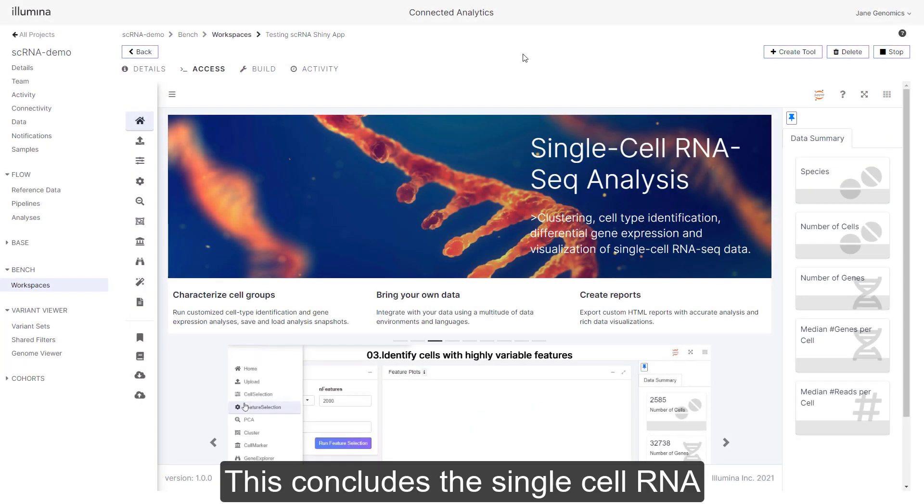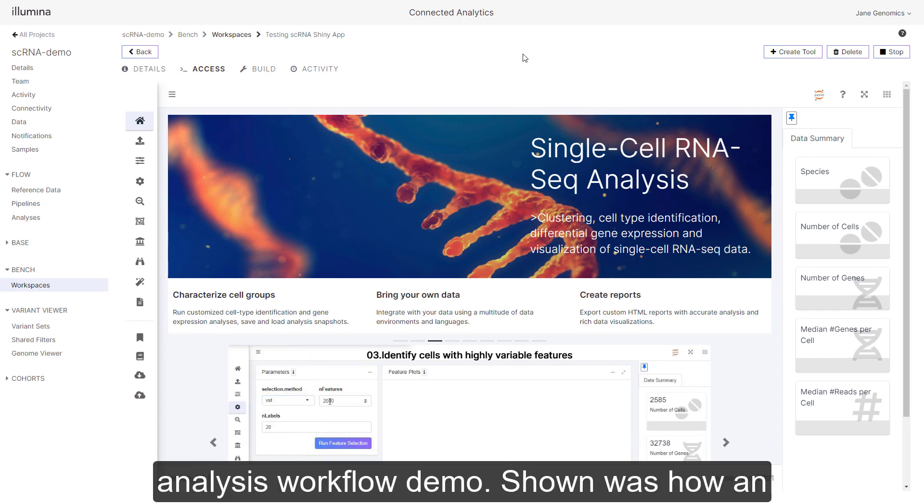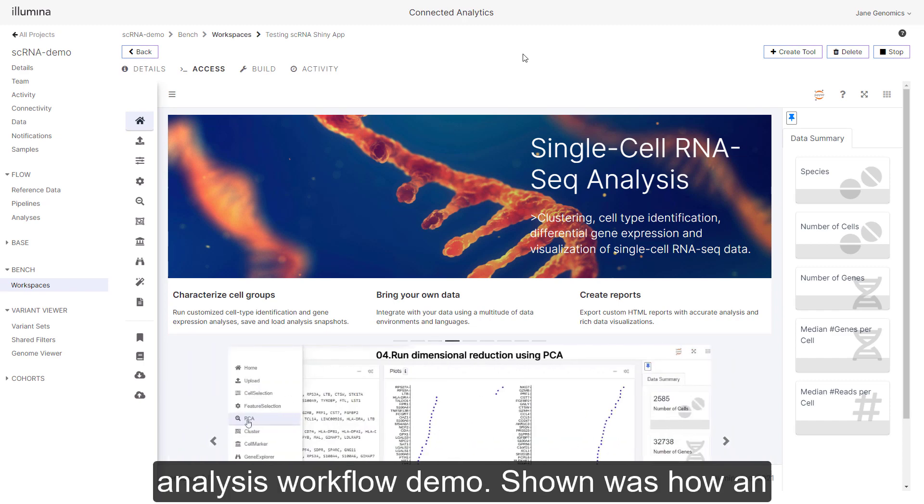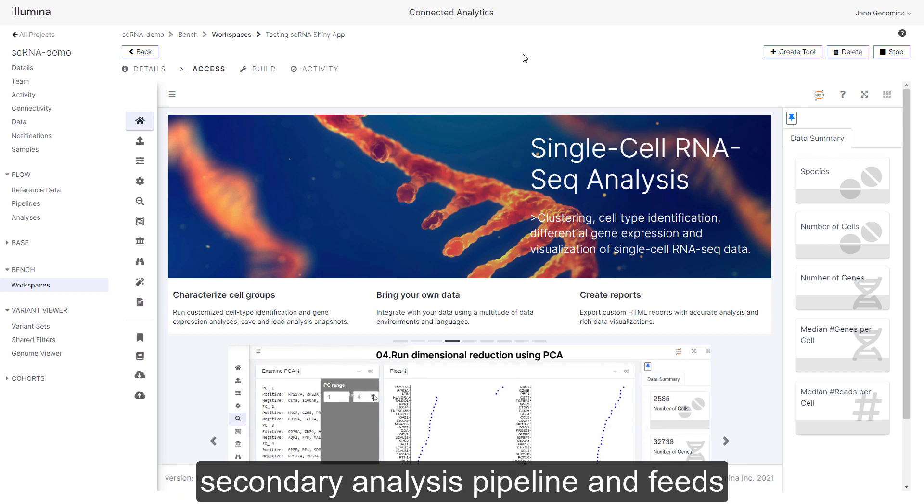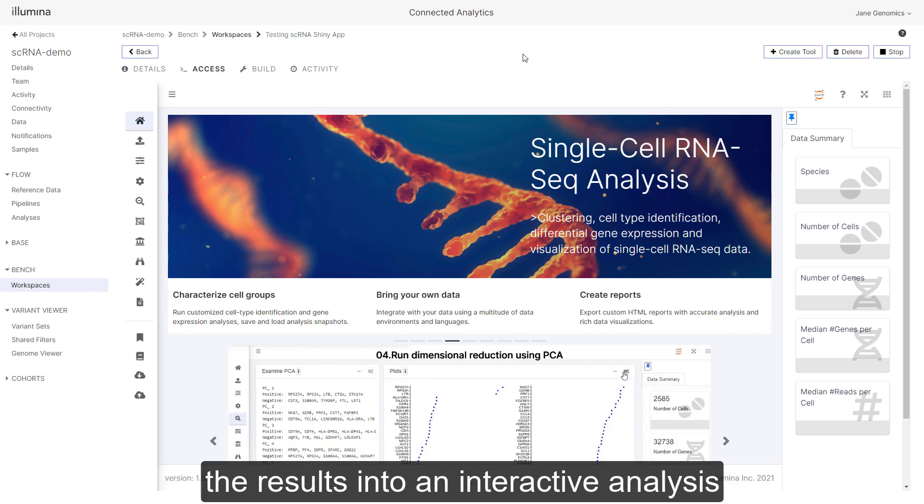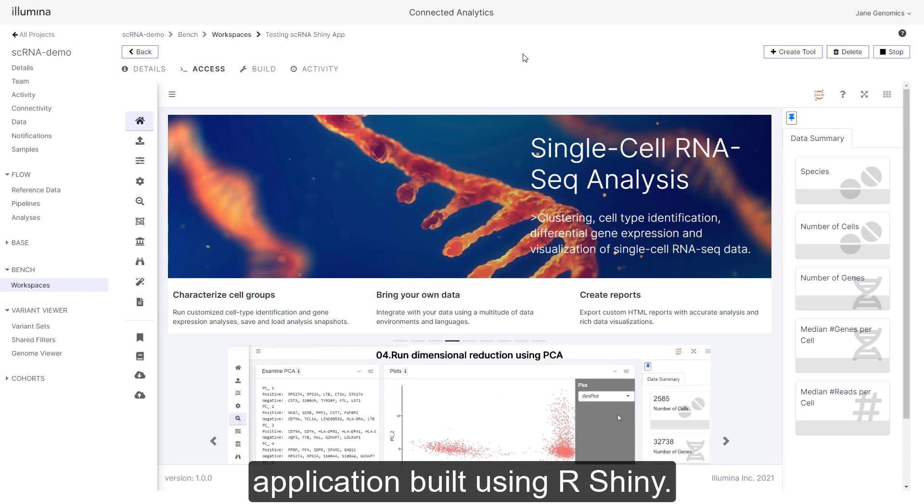This concludes the single cell RNA analysis workflow demo. Shown was how an ICA user runs samples through the Dragon secondary analysis pipeline and feeds the results into an interactive analysis application built using R Shiny.